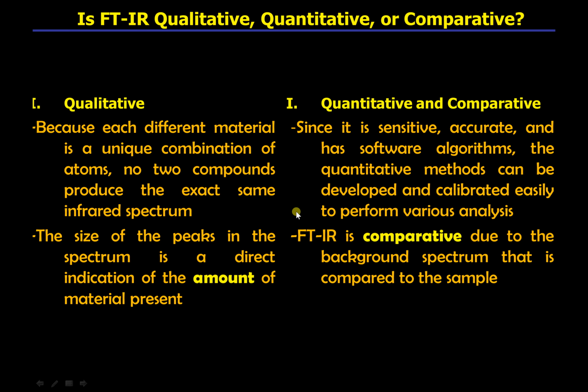Quantitative and comparative, since it is sensitive, accurate and has software algorithms, the quantitative methods can be developed and calibrated easily to perform various analyses. FTIR is comparative due to the background spectrum that is compared to that of the sample.